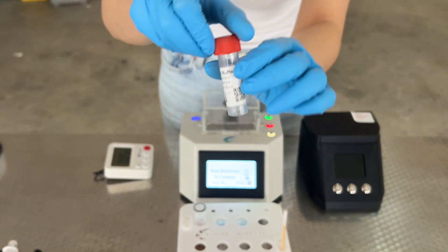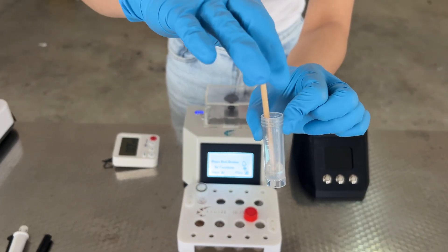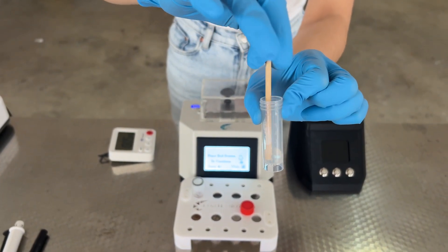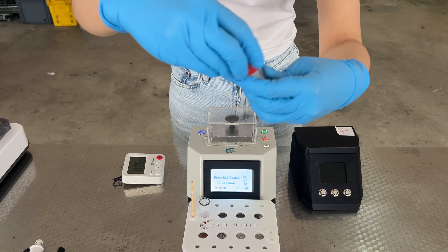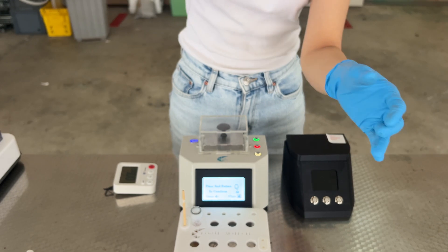Prepare the elution buffer. Once the stick is completely dry, insert into the elution buffer and whisk vigorously for 12 seconds. Cap the elution buffer tightly and give it a shake and flick to ensure everything is evenly mixed.